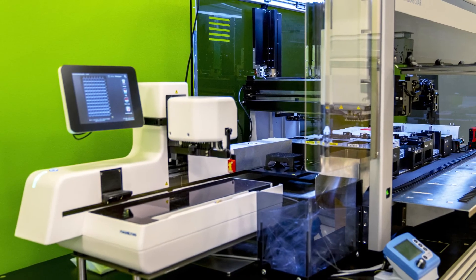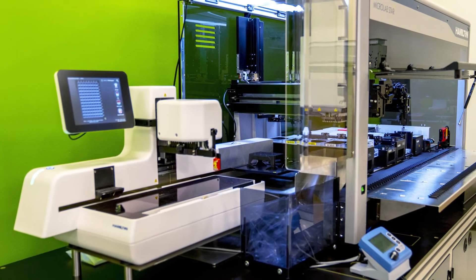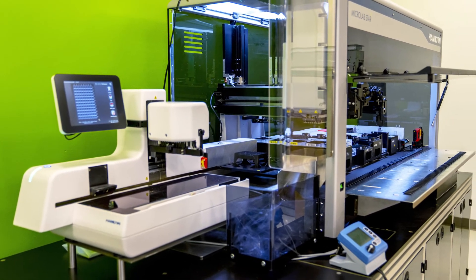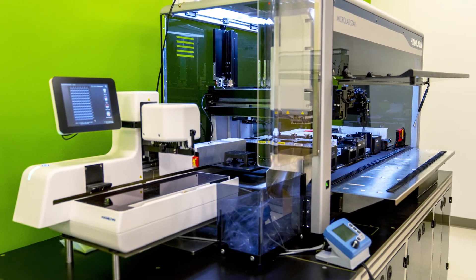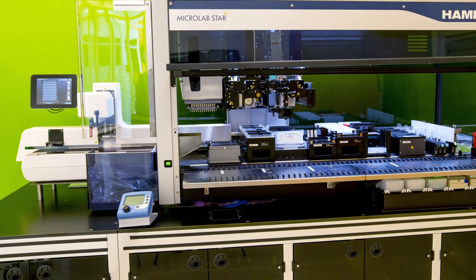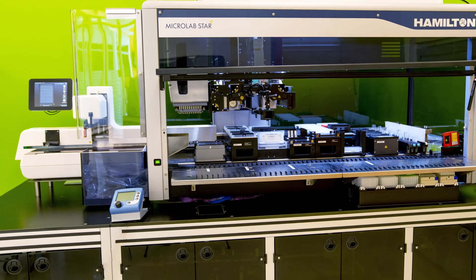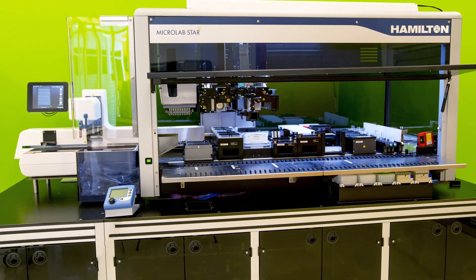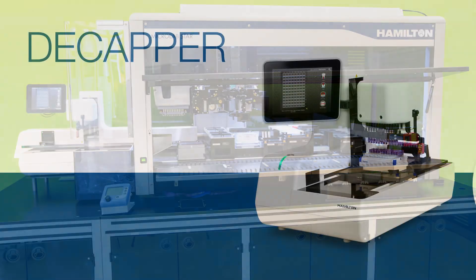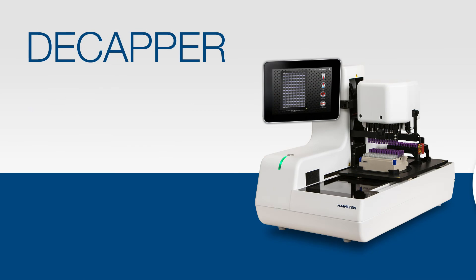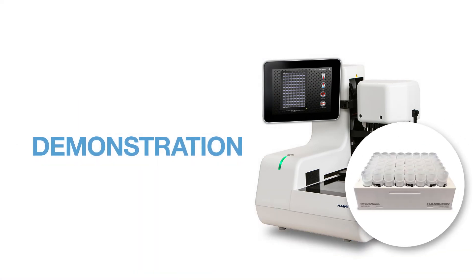If you are looking for a more customized integration, we also offer the LabElite integrated iDecapper, which features a longer rail in the back of the machine to allow for seamless integration specifically with our Hamilton Star Liquid Handler. Now that we've reviewed the features and benefits of the LabElite Decapper, let's get started on our product demonstration.